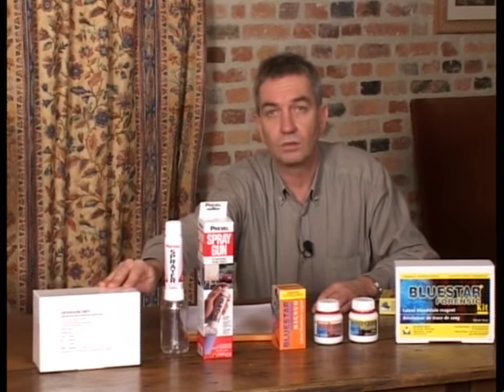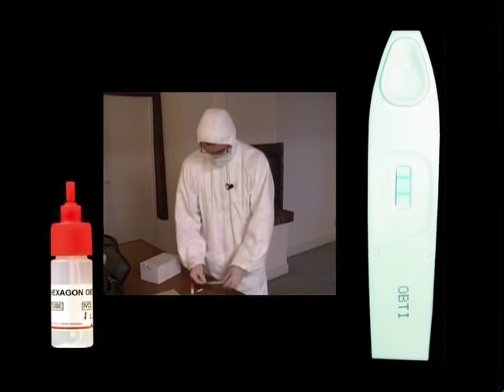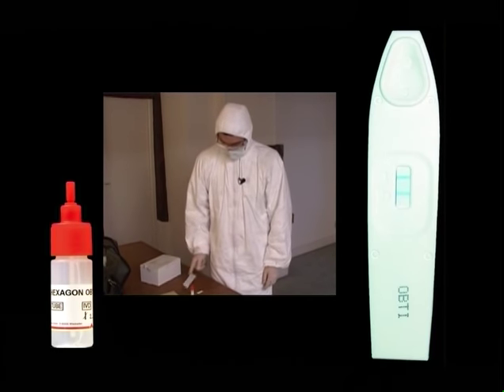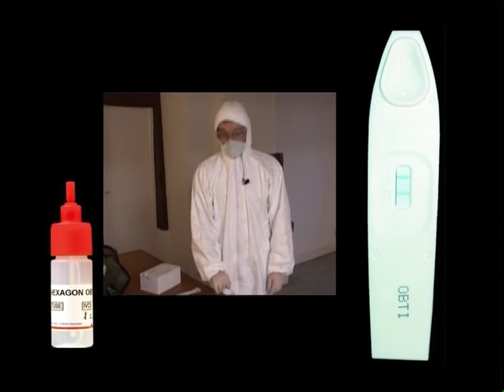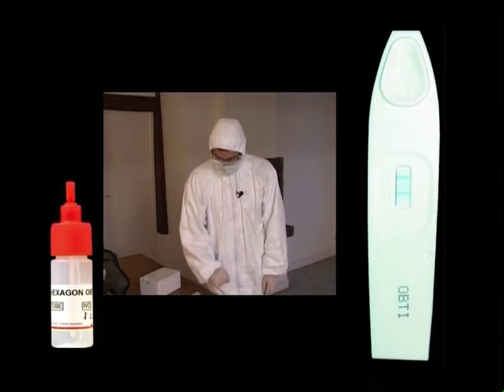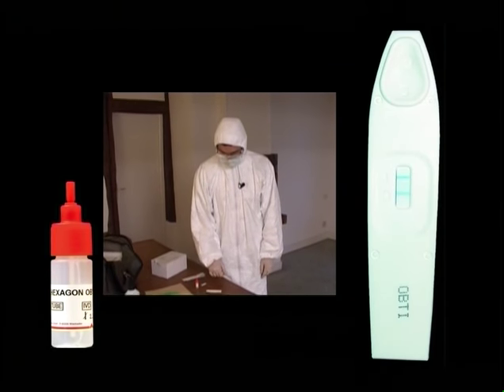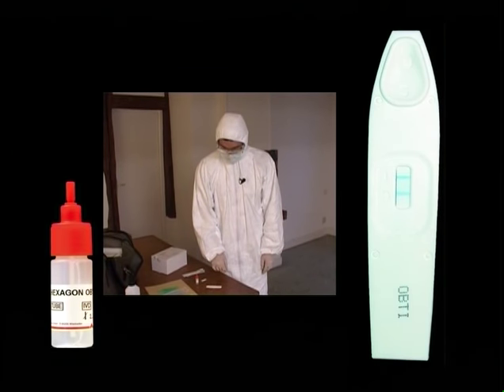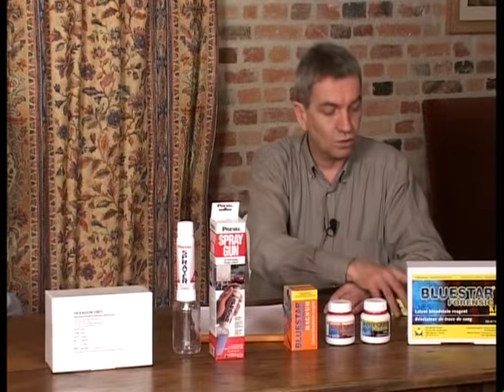And finally, Hexagon OBTI, which is a fast immunochromatographic test that can distinguish between false positives and real reactions to blood. It also distinguishes between animal blood and human blood as soon as a trace of what is thought to be blood appears. The Hexagon OBTI test will only react positively in the presence of human or primate blood.